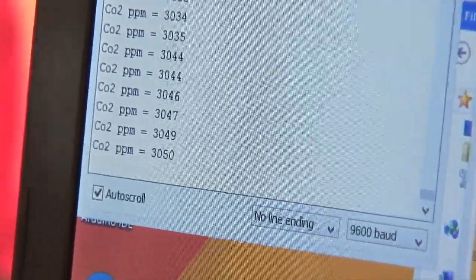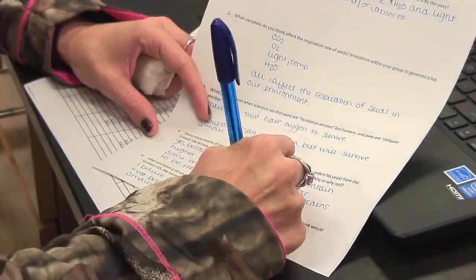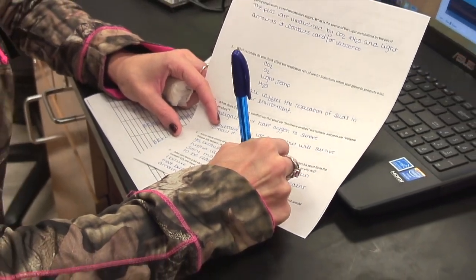With the new lab, the students can directly see, they can actually look at the computer screen and see the carbon dioxide in parts per million. And it not only connects the actual experiment to carbon dioxide into the net reaction of cellular respiration, but it also connects them to the actual CO2 levels in the room and the graphs that they may have seen of the amount of CO2 levels in our atmosphere.